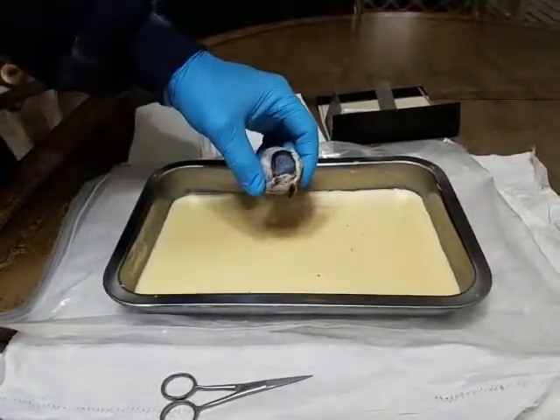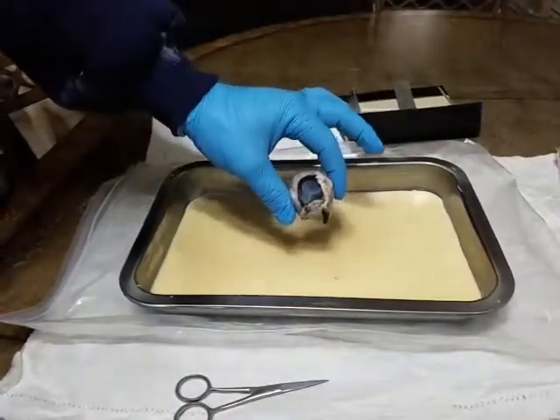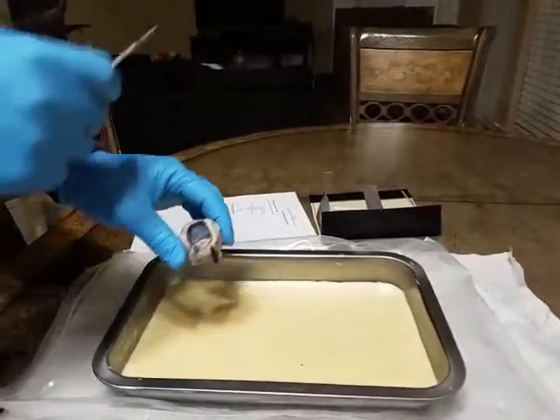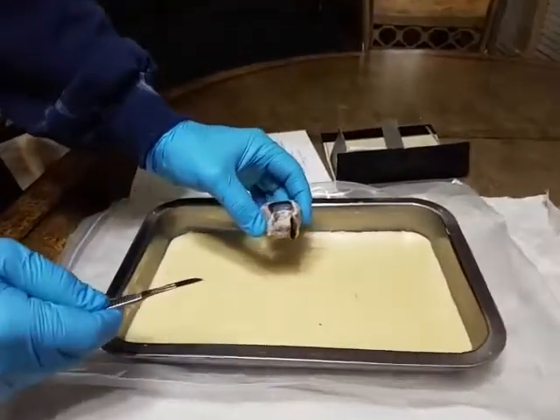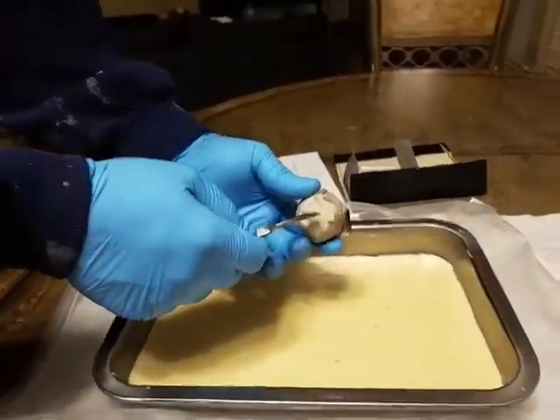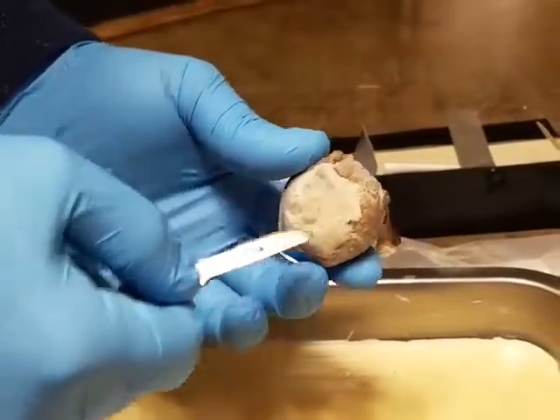Partial or some of the dissection of the cow's eye. You can see my table all around, my paper, so it has the questions on it. We're going to start with the CN2 optic nerve. It's supposed to come out the backside, and I don't know if it was supposed to be hanging off or if that's all of it mushed in.